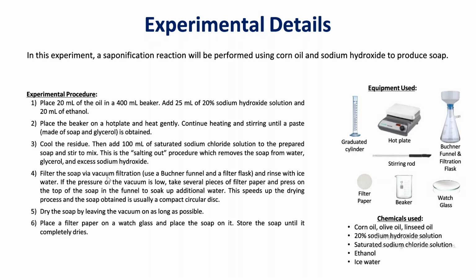Dry the soap by leaving the vacuum on as long as possible. Place a filter paper on a watch glass and place the soap on it. Store the soap until it completely dries.